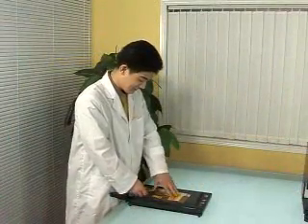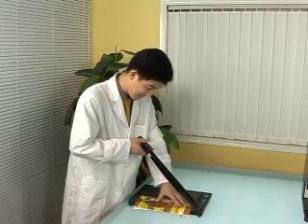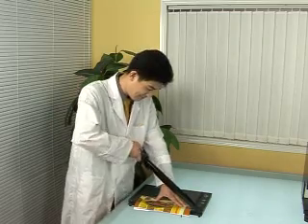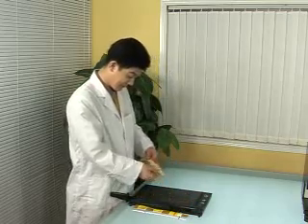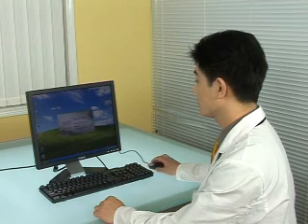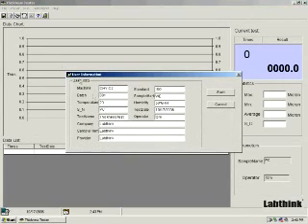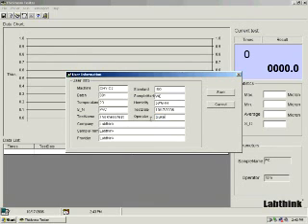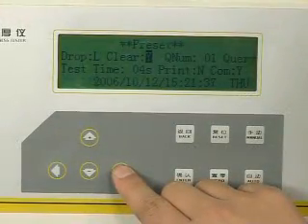The width of the specimen is about 100mm. There should be no creases or other defects on the specimen. Start the thickness tester software on the desktop, then set computer parameters and instrument parameters.